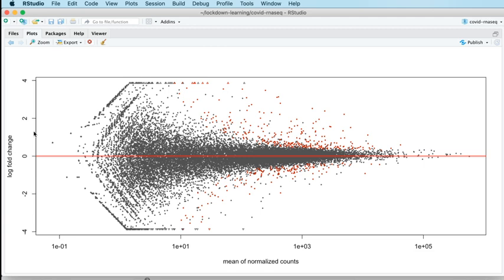So if we drew a line across at 1, you would see some genes fall closer to the 0 line than that. And that's because DESeq hasn't applied the same thresholds that we've applied. So the 141 are all a part of that set of red points, but that isn't all of them. There are more than that.